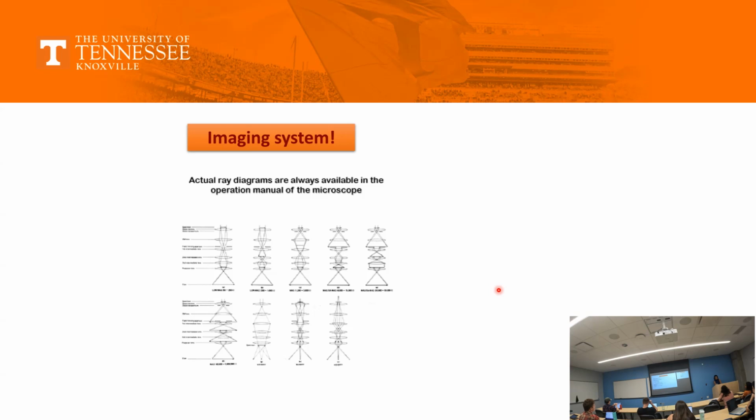We can start by putting the sample into the sample holder, taking simple images, and then start understanding the diffraction pattern. For those of you who volunteer, I have some training sessions that I do with other students.